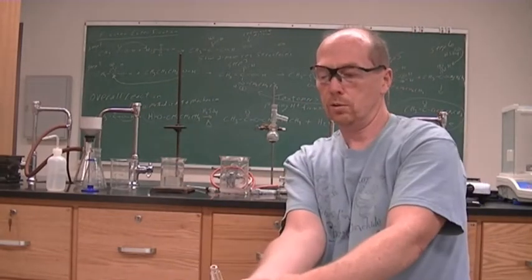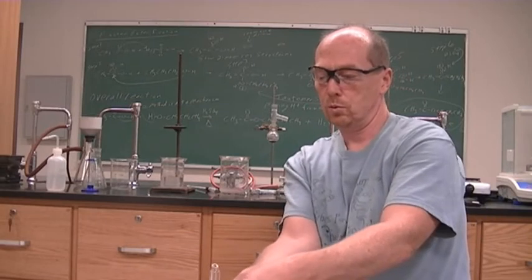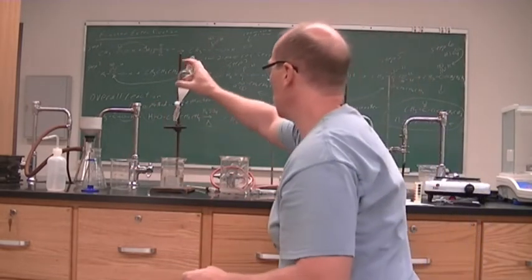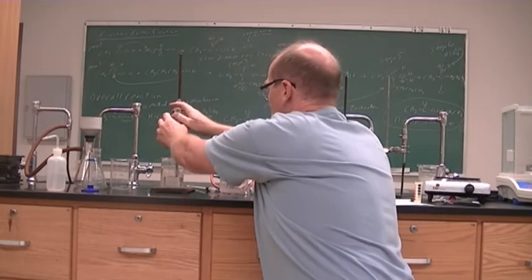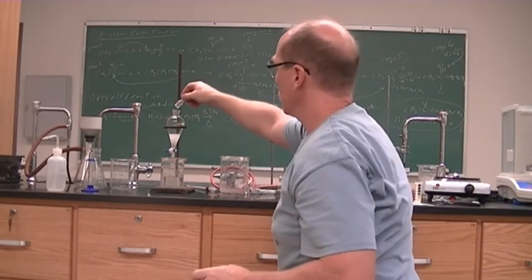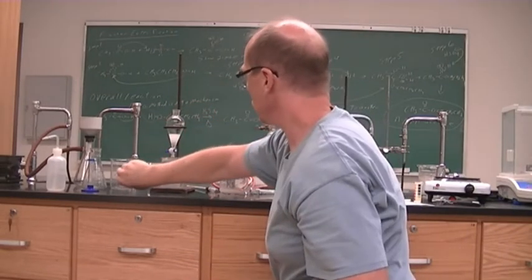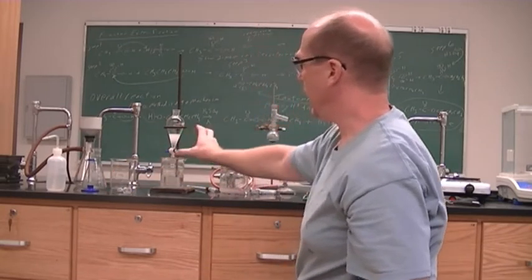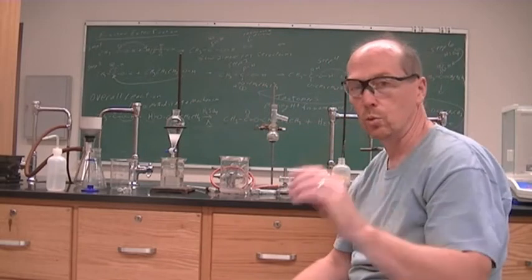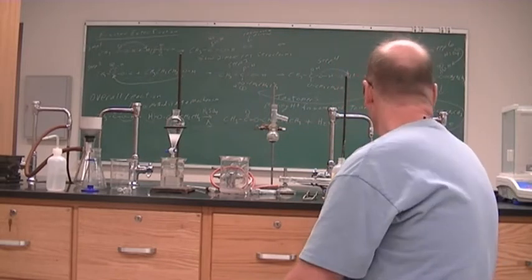All right, so that's that. Let it separate, take the lid off. All right, so right now it is cloudy. We have to give it a minute to get the nice two layers, and then take off the bottom layer.